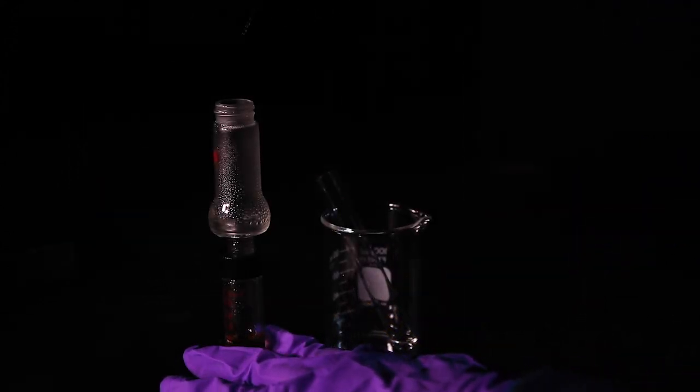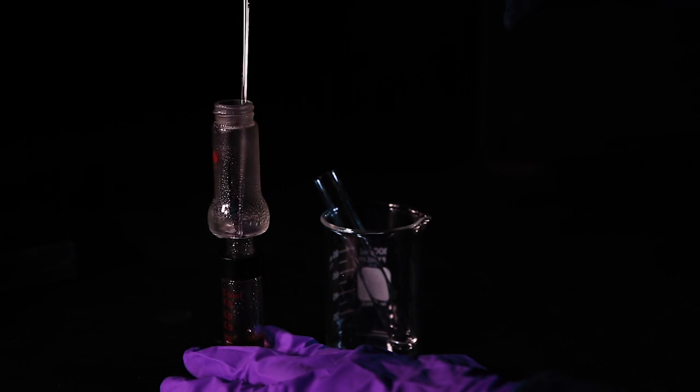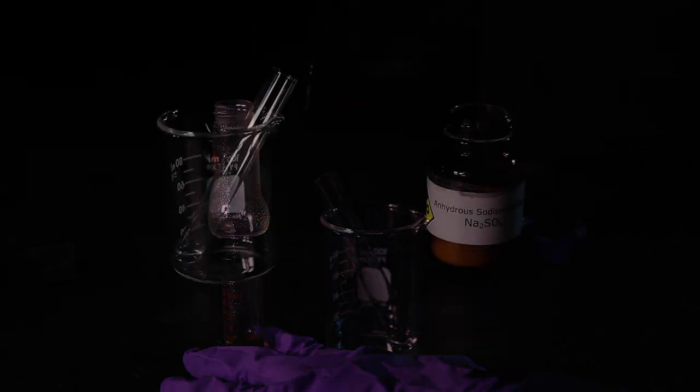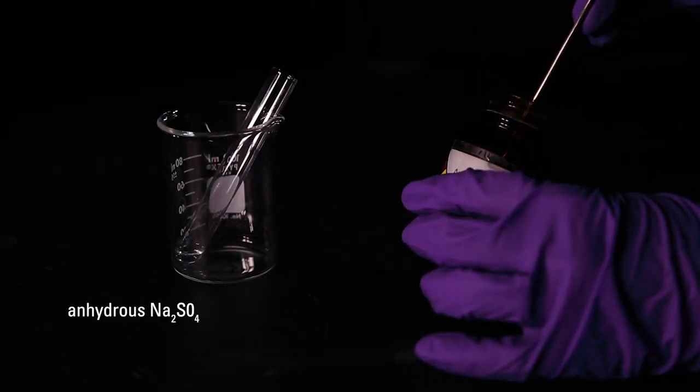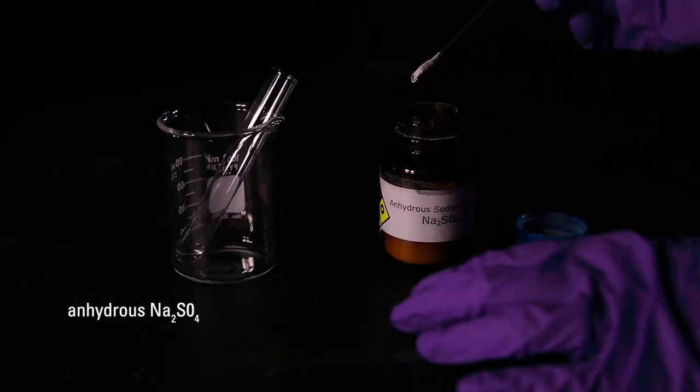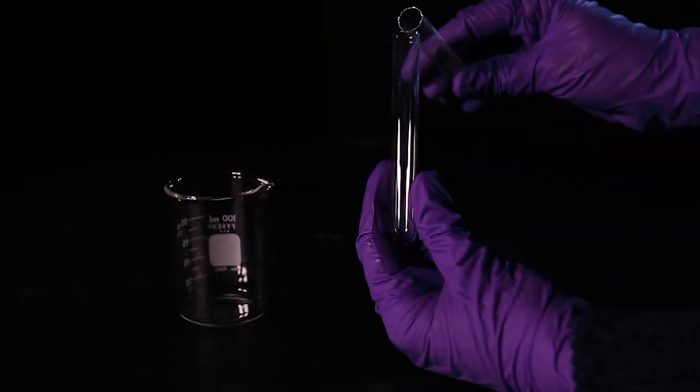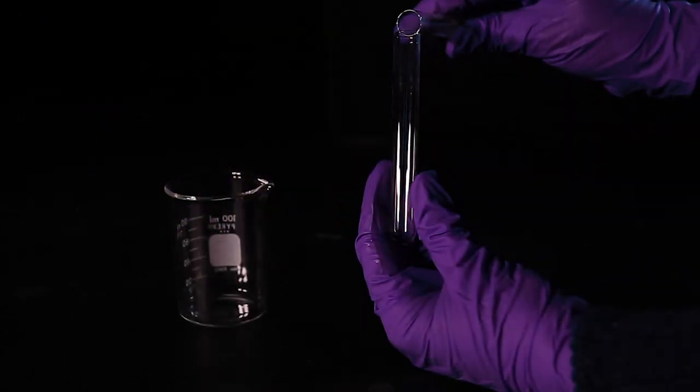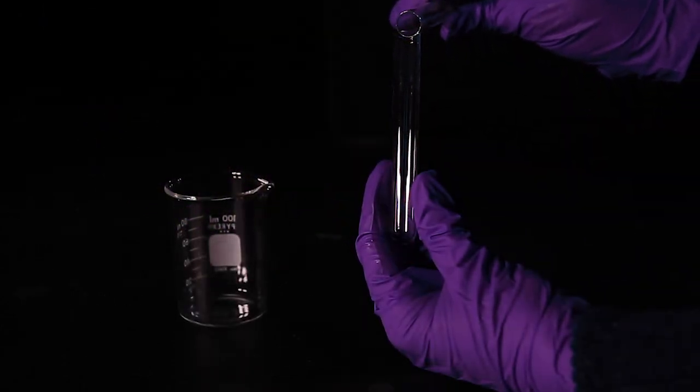Using a long-stemmed Pasteur pipette, transfer the liquid accumulated on the lip of the stillhead to a clean test tube. Add a small amount of anhydrous sodium sulfate and let it dry for two minutes. Carefully transfer the dried liquid into a clean test tube.